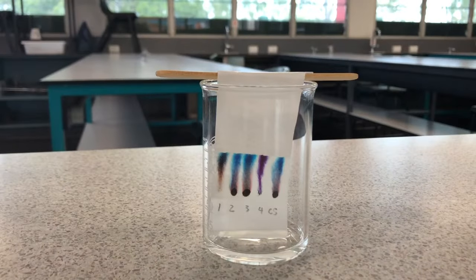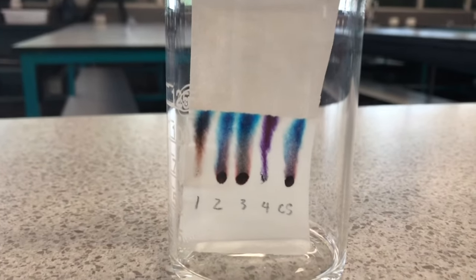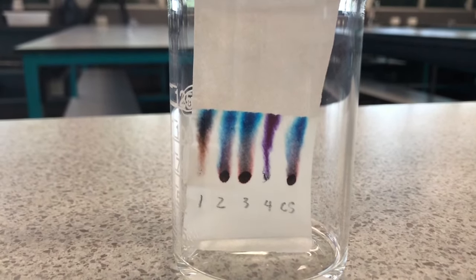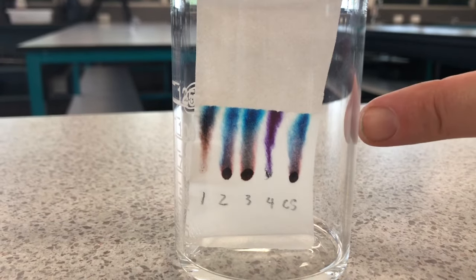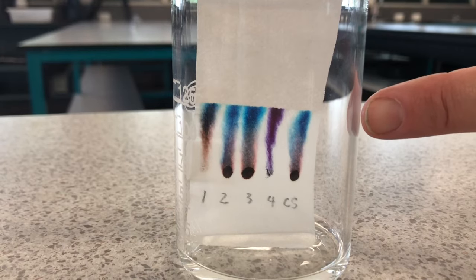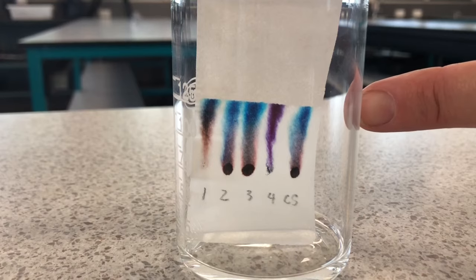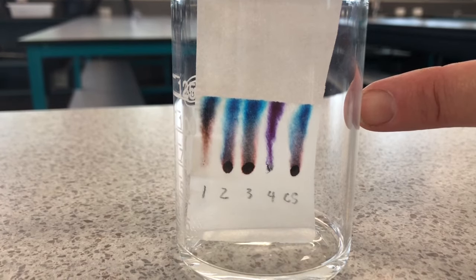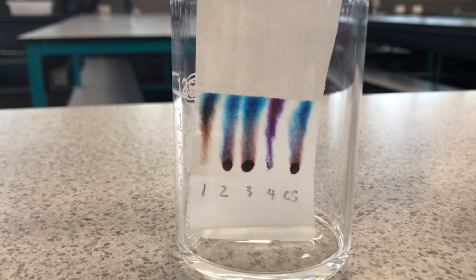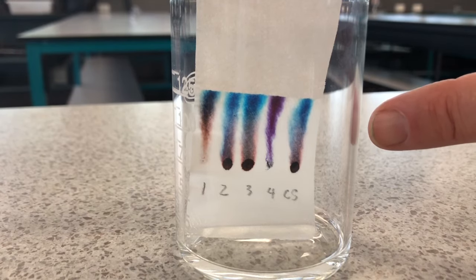Can you guess which one is the crime scene pen? It's probably not one, and it's probably not four - the crime scene one has a lot more blue in it, so I definitely don't think it's four. We're trying to work out if it's two or three. I'm guessing it's probably two - you can see how three has a lot more red early on.